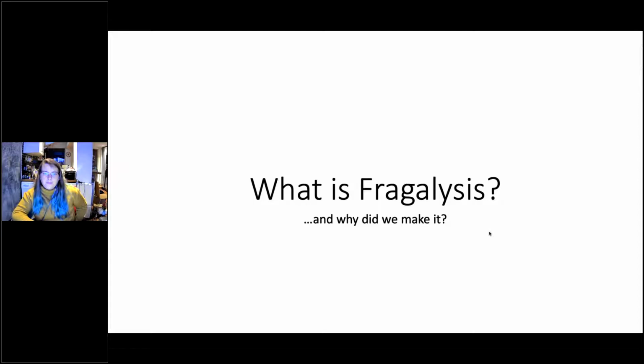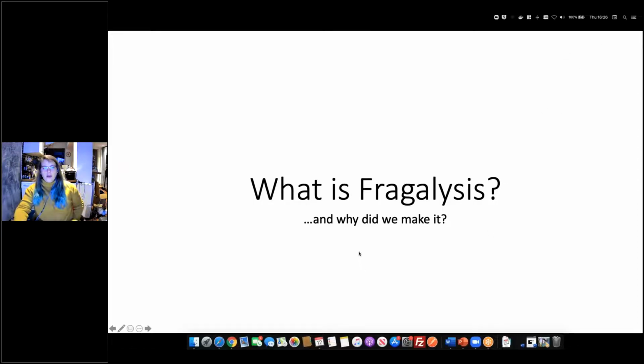That's great. Thanks very much. No worries. Okay, so what is Fragalysis and why did we make it?